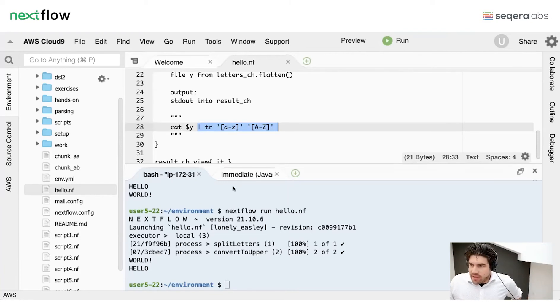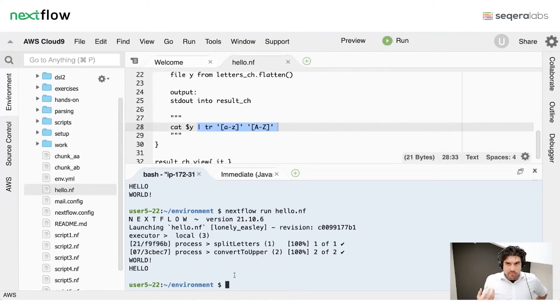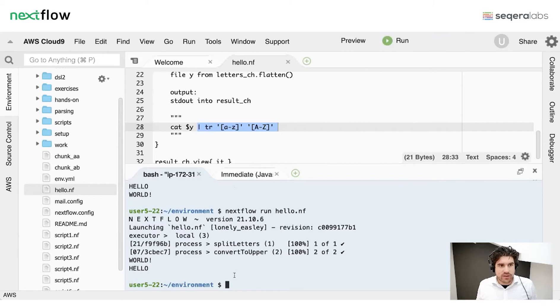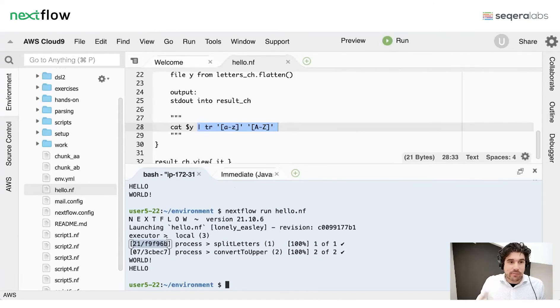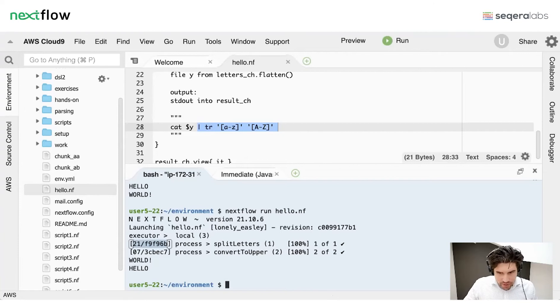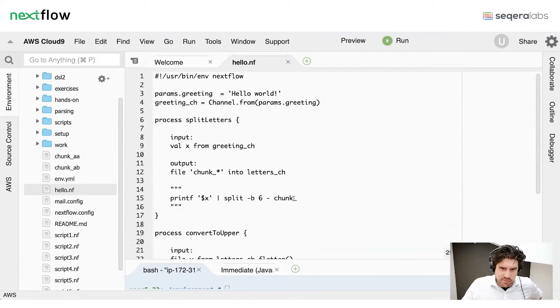Another point: each process has a hash number. Remember, each process is independent and lives in its own working directory — it's encapsulated. This hash is essentially the location of where that work is taking place. If you run yours you'll have a different number because this number is built from all the inputs, all the scripts, the time, etc. — it's unique for that process. We'll go through where that comes from in a moment, but let's first start with the actual definition of the pipeline.